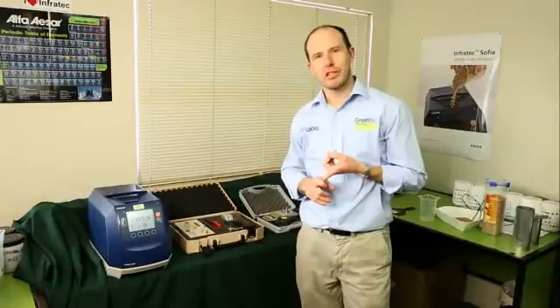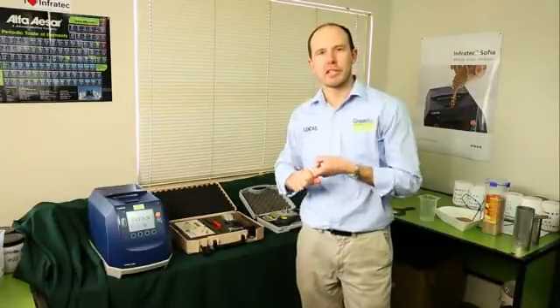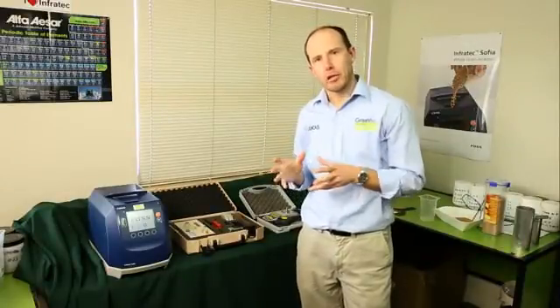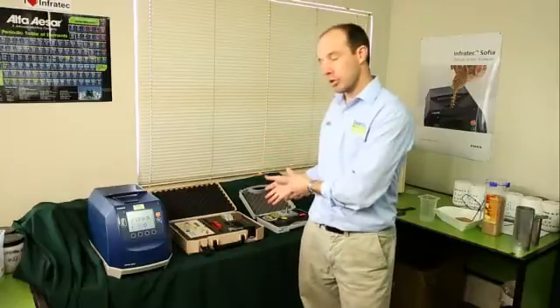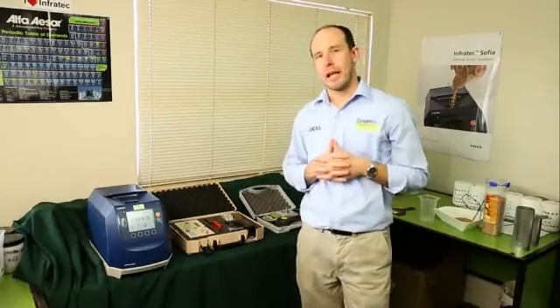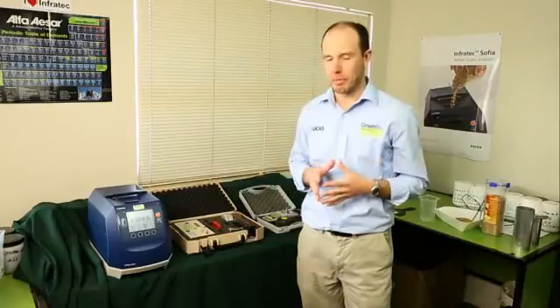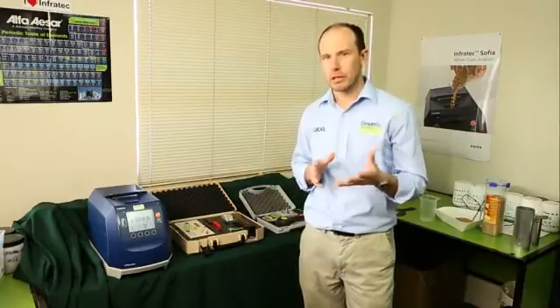But what if there's no green grains in your sample and the temperature's the same and the reading from a handheld moisture meter is still not the same as the reading that you're getting at the depot? Well, it's a good question.